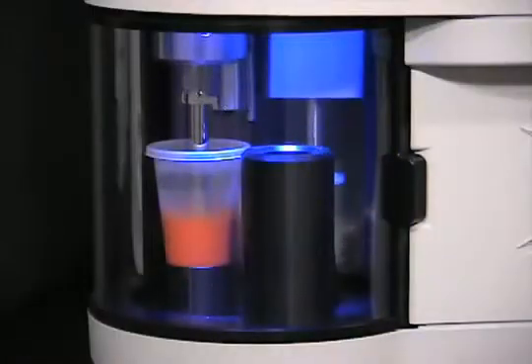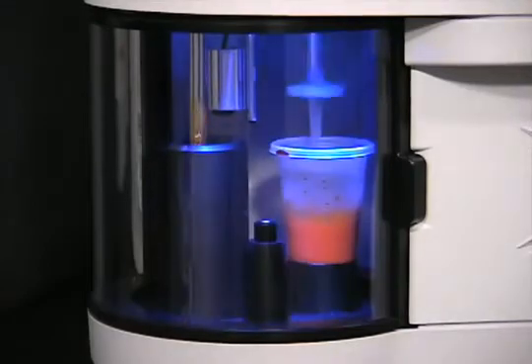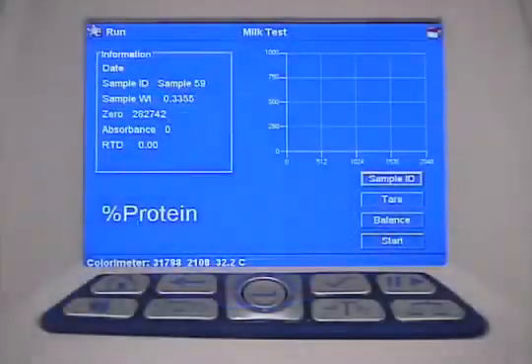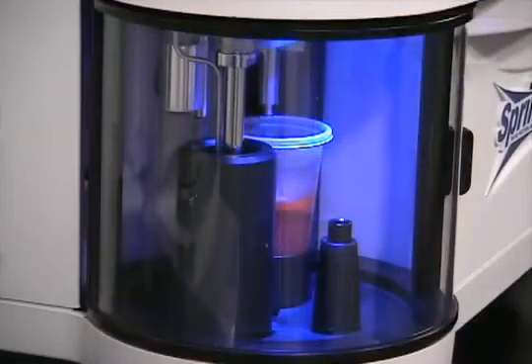The filter is picked up by the detector inlet. The homogenizer is cleaned with warmed jets of mild detergent, while at the same time a portion of the remaining ITAG solution is drawn through the filter into the detector to determine how much ITAG was bound to the protein. No sample comes in contact with the detector, only filtered ITAG solution. Sprint then calculates the percent protein present in the sample.